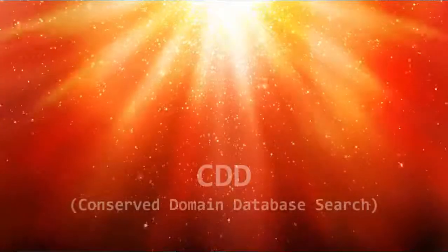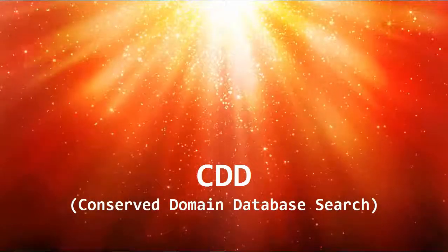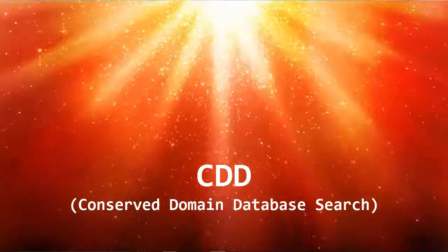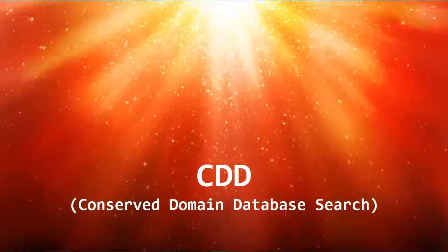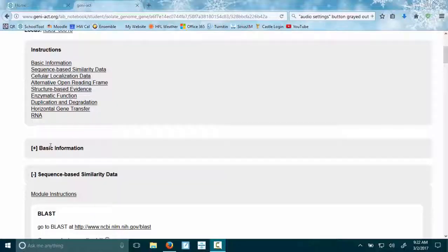Going to continue in the sequence-based similarity section, which is module number 2. And whether you're doing this right after you did your BLAST or at a totally different time doesn't matter, okay? Because we're recording things in our notebook online here at GENI-ACT, you always have the ability to go back, which is nice. These are modules, so we can do them at different times.